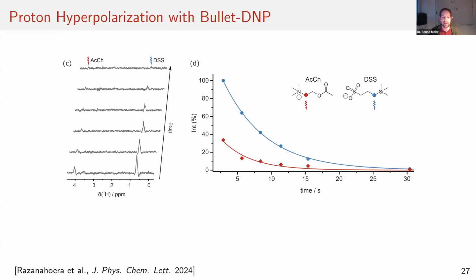So we also actually did an experiment together with Jeffrey Bodenhausen's group at ENS Paris last year, or we published it last year anyway, with protons. So this is not the subject of this talk. This is long-lived states.